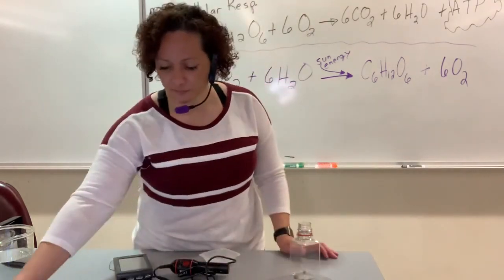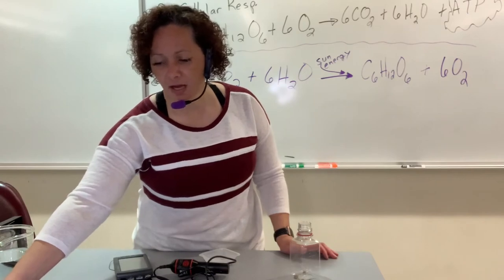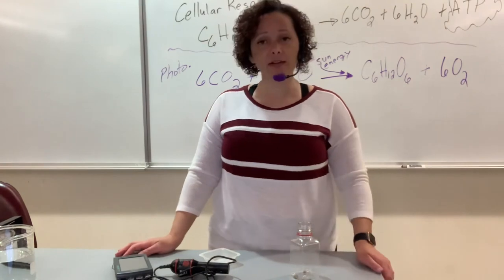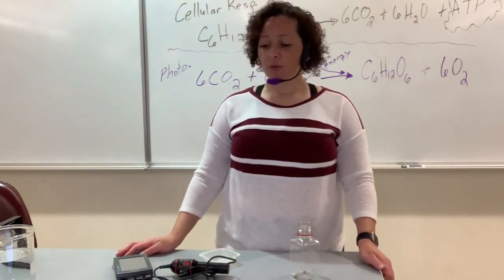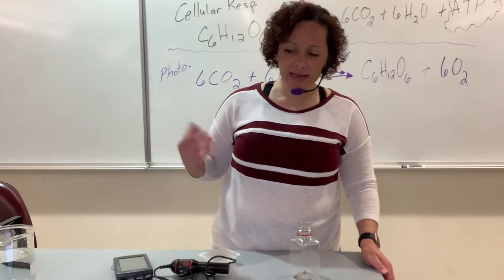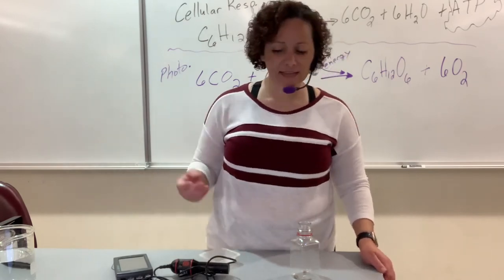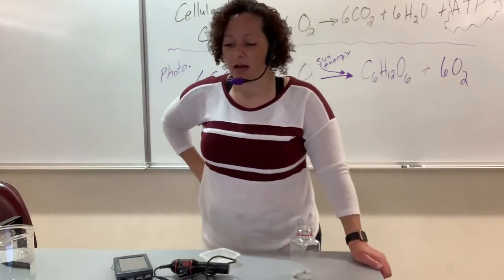Alrighty, so once you have done that and you've collected your data, you then need to figure out the average respiration rate. So I'm now looking at your table number 3. Table number 3 will be the average respiration rate for your organisms. And so as you can see, the organisms: animal in the light, animal in the dark, plant in the light, plant in the dark, seeds in the light, seeds in the dark. I'll let you know, depending on your lab, what we'll be using.